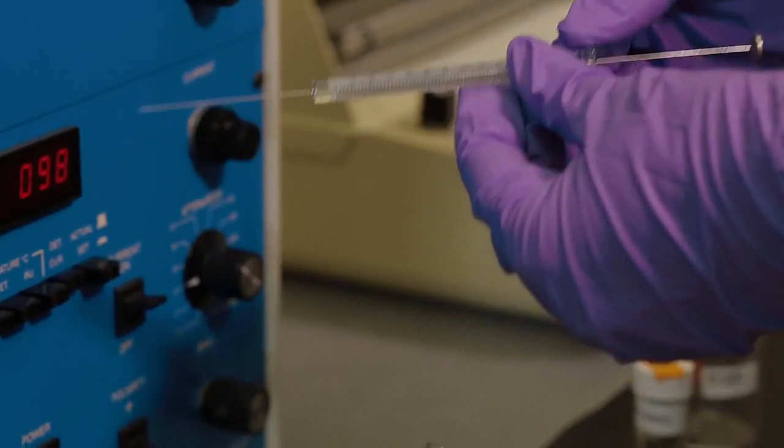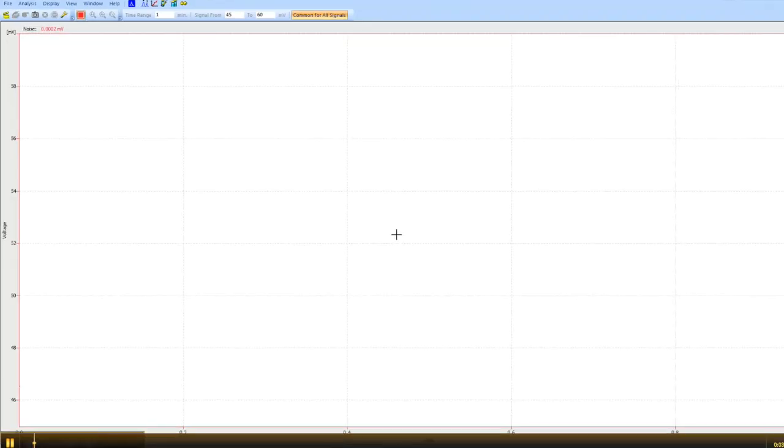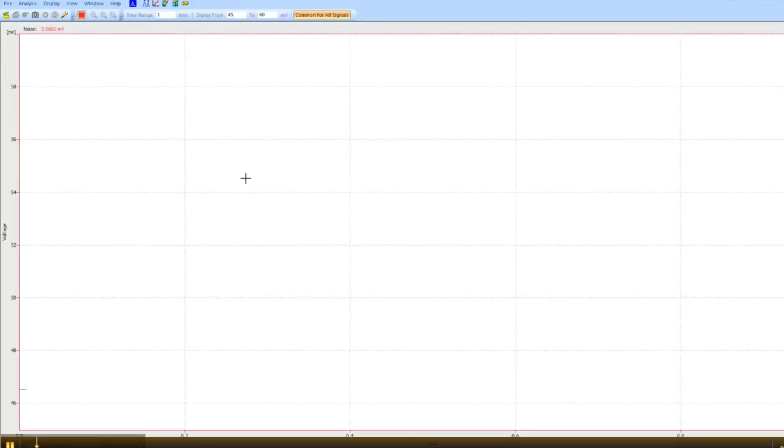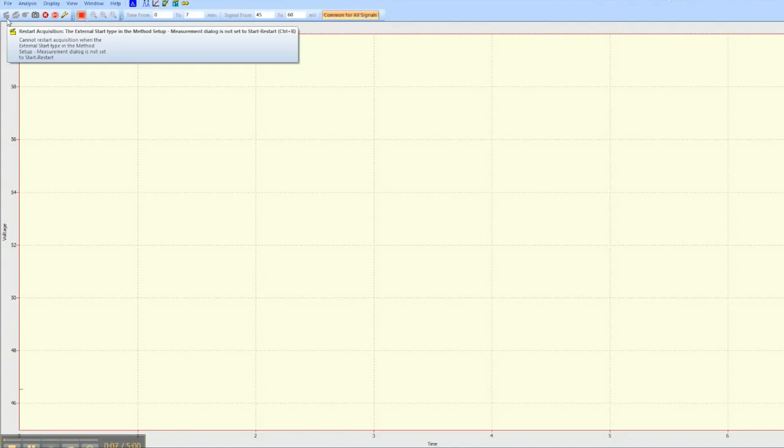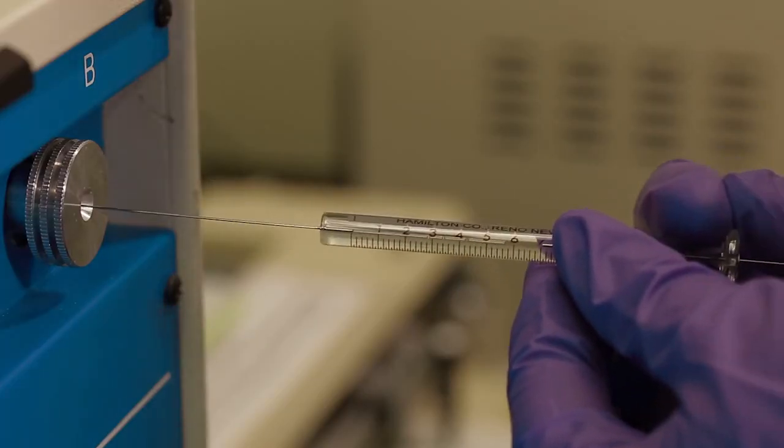Once the sample is loaded into the syringe, click the Data Acquisition button to open the Data Acquisition screen and click the Run Acquisition button on the top left corner of the screen. Now you can insert the needle into the GC injection port.